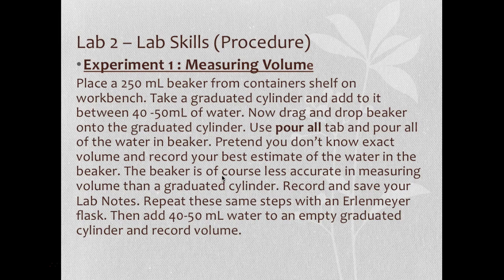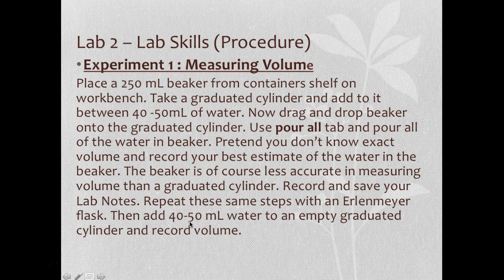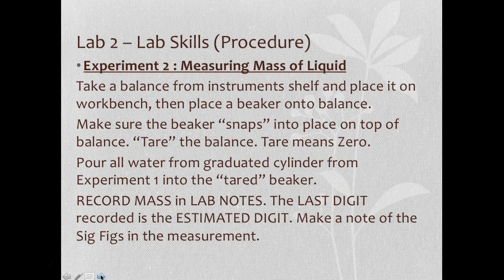Repeat the same steps using an Erlenmeyer flask — a triangular-looking flask. Add approximately 50 mL of water into the Erlenmeyer flask using the graduated cylinder. Again, the Erlenmeyer flask is not accurate for measuring volume, so make a guesstimate. Finally, refill the graduated cylinder to approximately 50 mL and record that volume. You've now recorded volumes using a beaker, Erlenmeyer flask, and graduated cylinder.